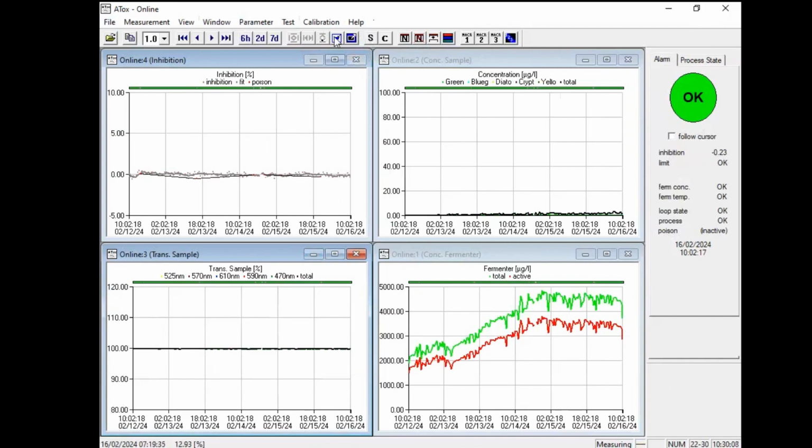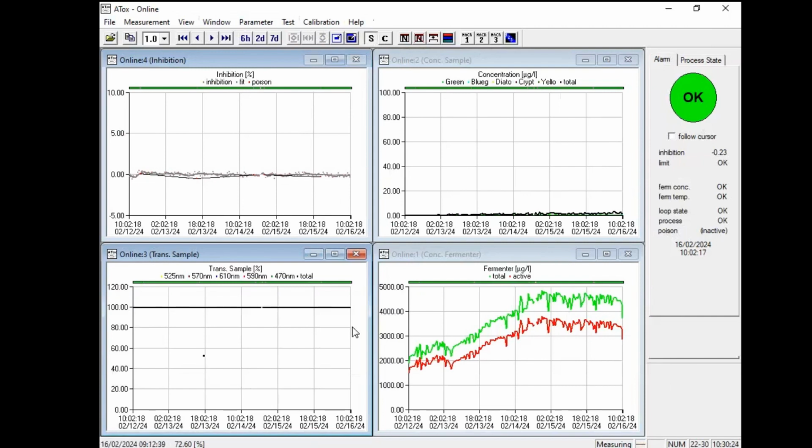So, you see my rectangle is gone and I cannot zoom in or out because the rectangle is not there. Okay, I want to turn it back. You see auto scale Y, and this is the normal scaling now back.